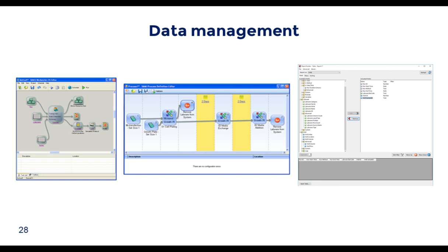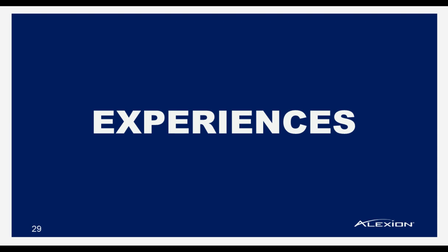A lesson learned here is to confirm remaining database space prior to beginning a campaign. The database requires sufficient free space to fully record operations and to operate efficiently. Depending on your workflow, database size used at each step in the campaign can vary. The database must be properly configured to contain the data generated. Periodic archives are a good way to maintain available space.